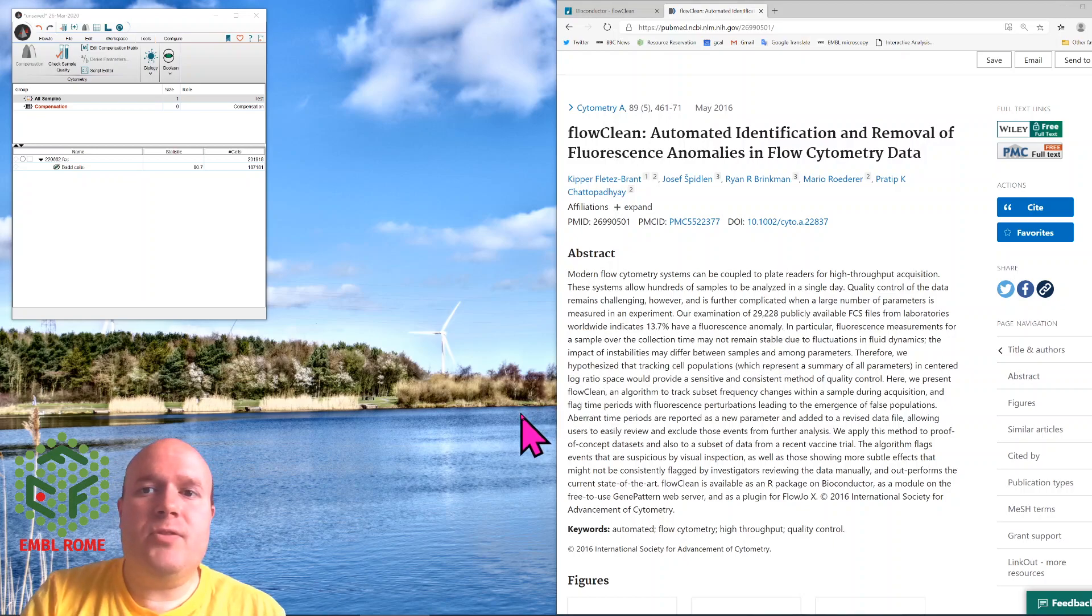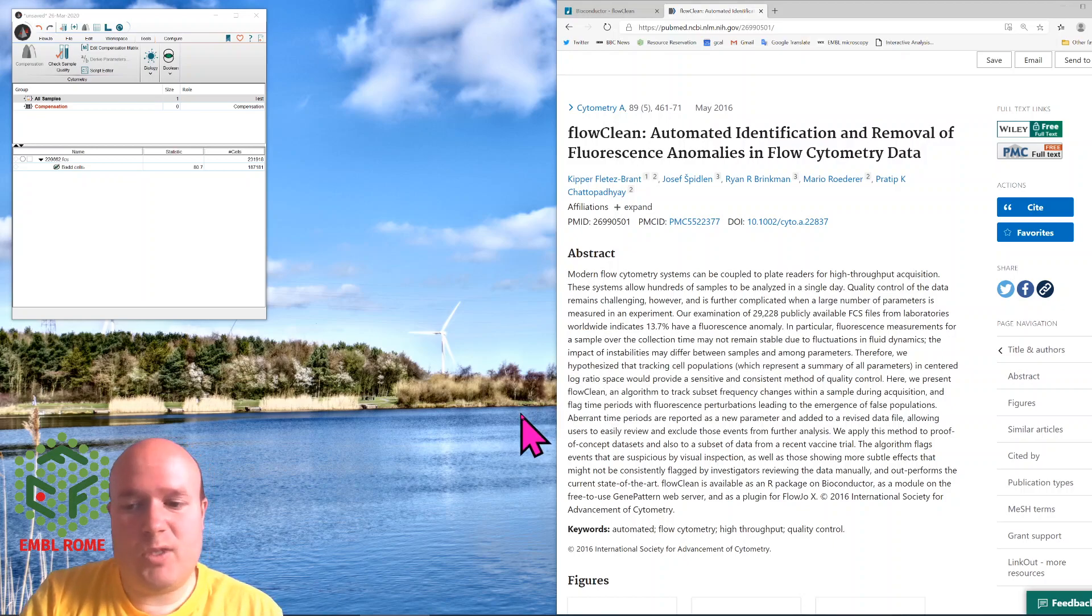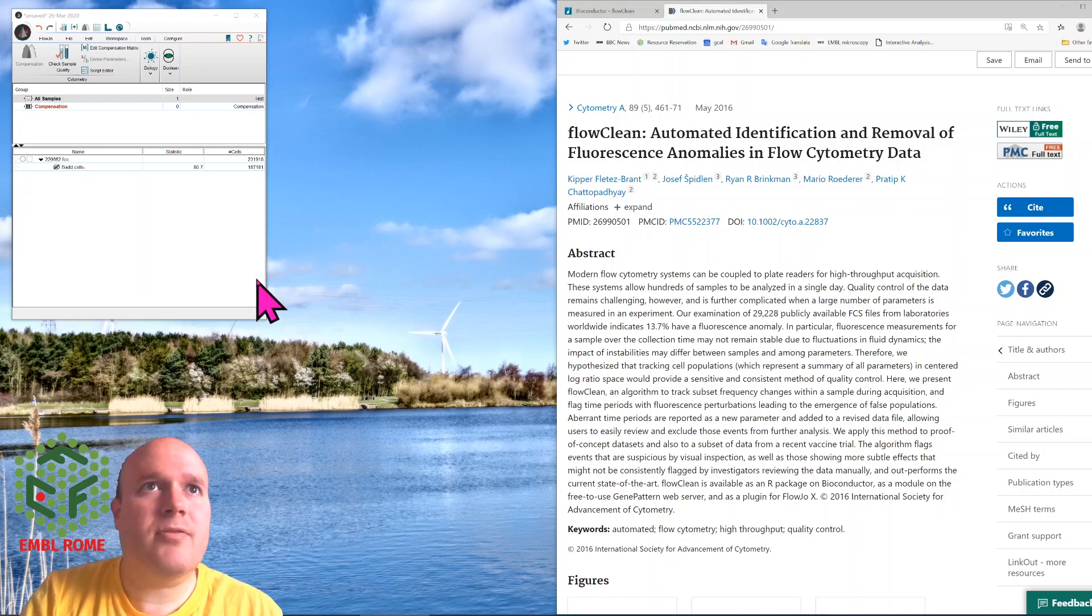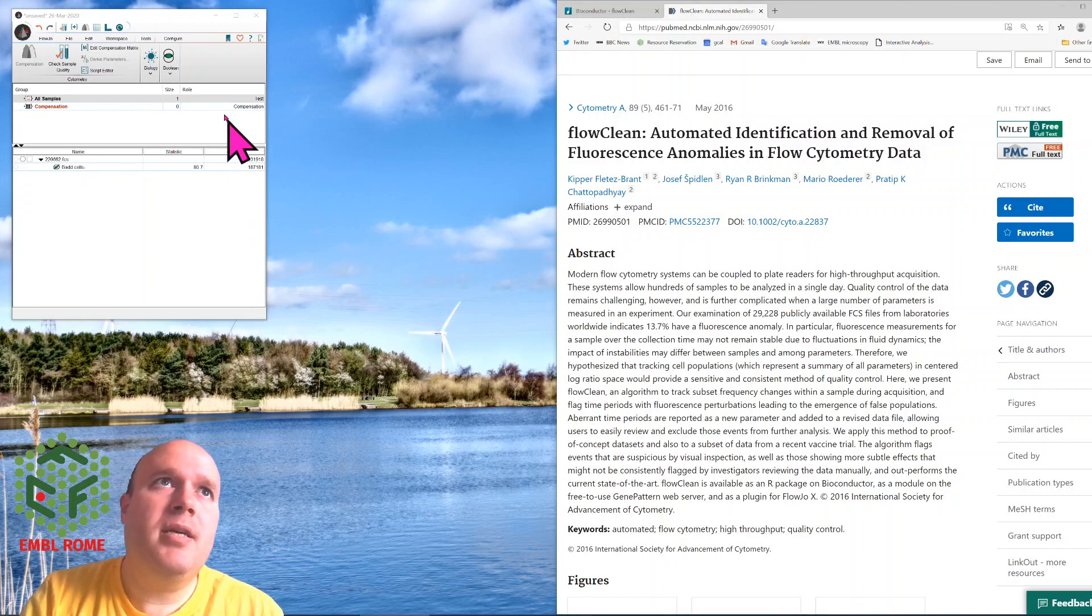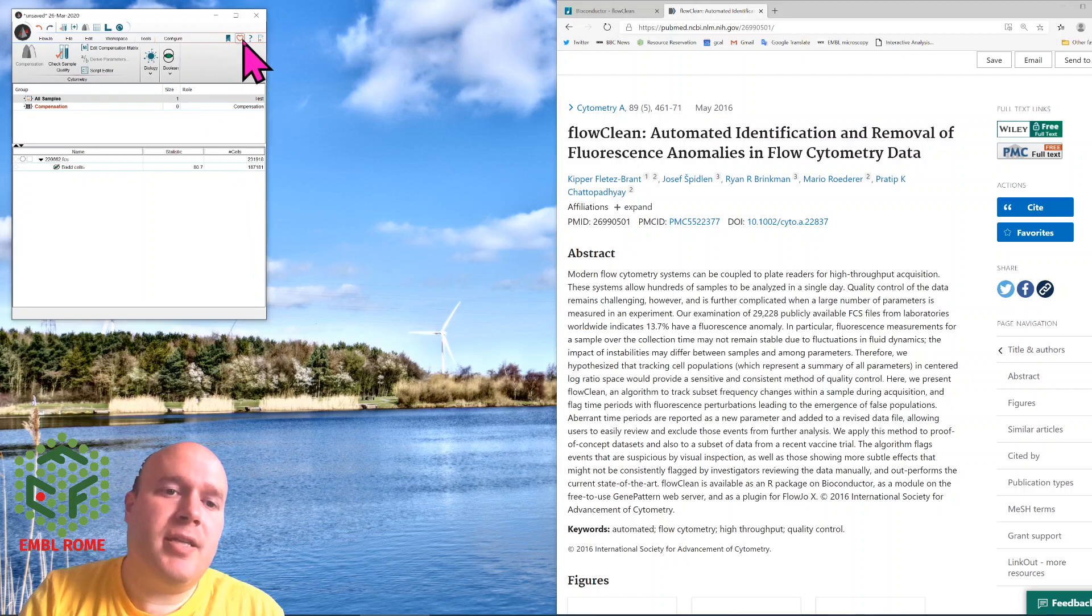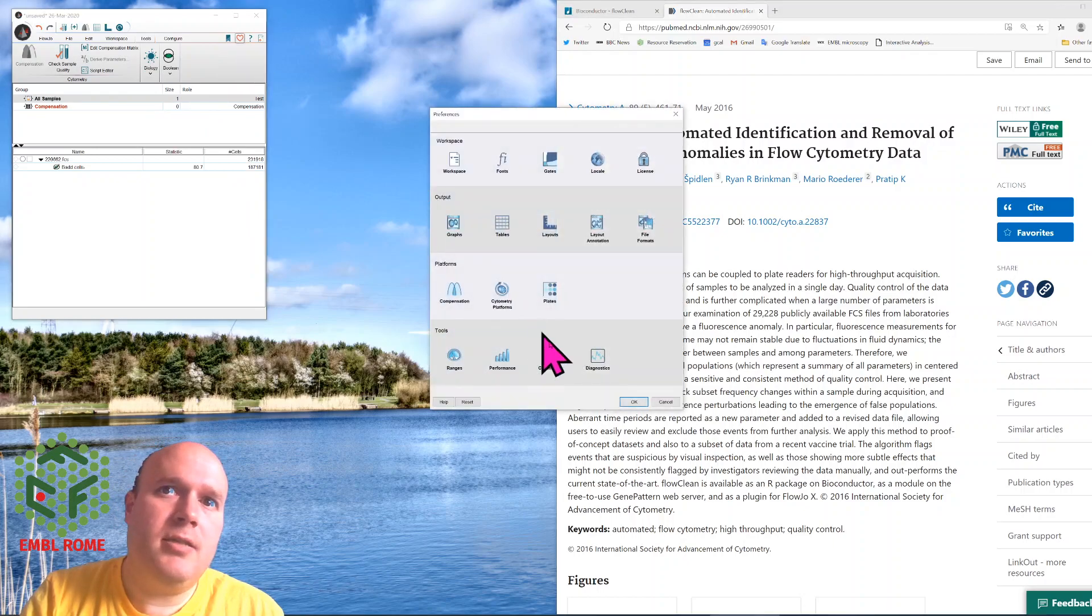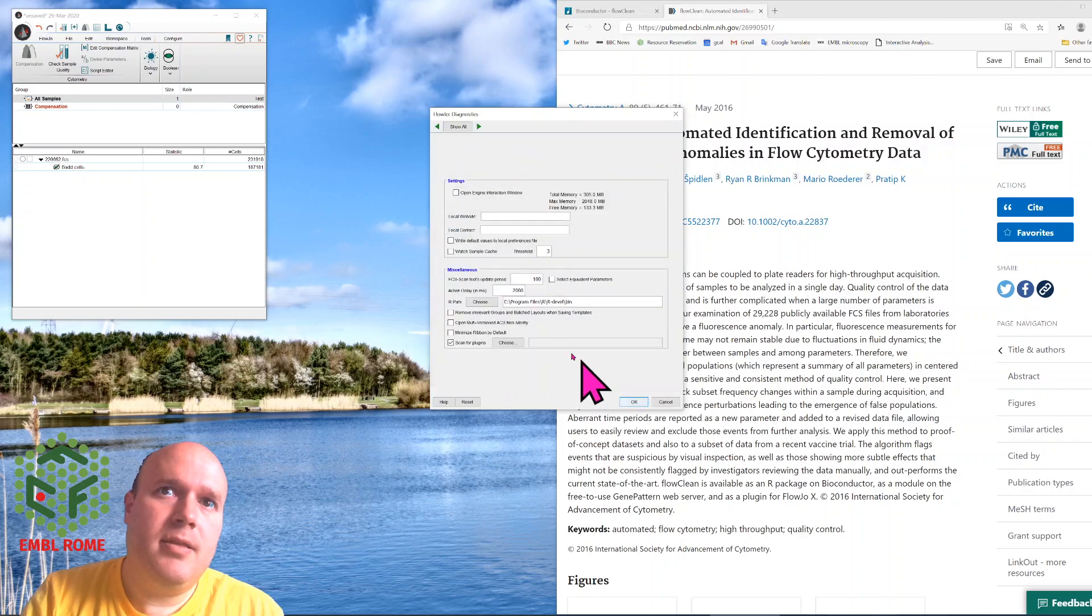First of all, you have to install R. Go to Google or Bing and search for R and install it into your system. Then on your FlowJo, you have to click on the Preferences button, which is this heart, click on Diagnostics, and point FlowJo to R.